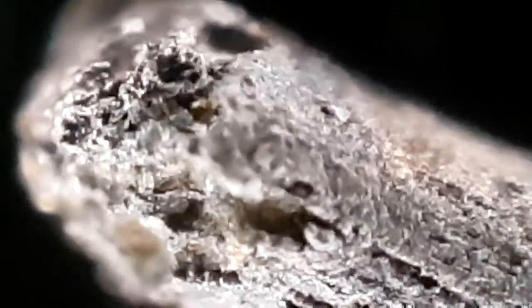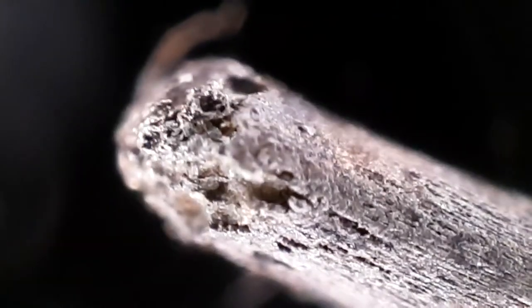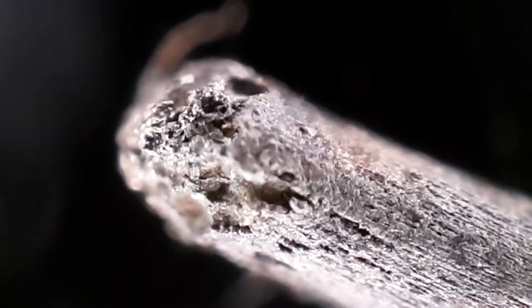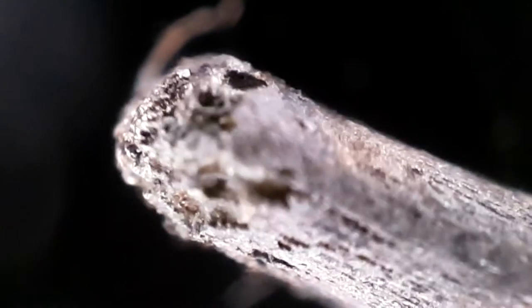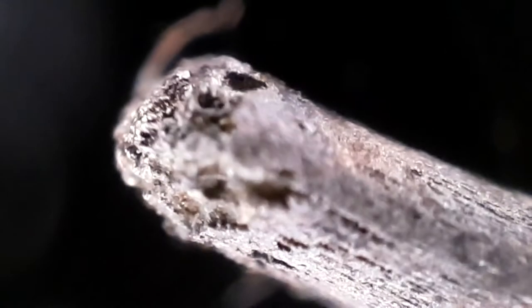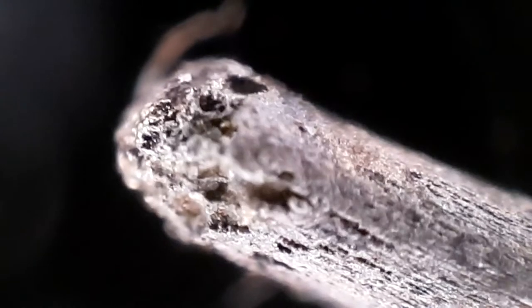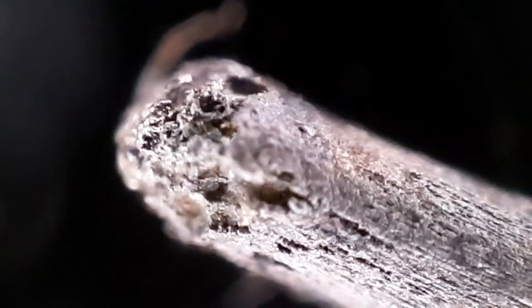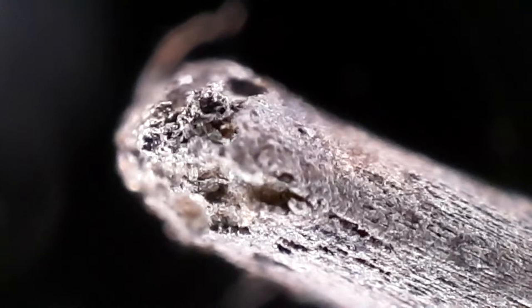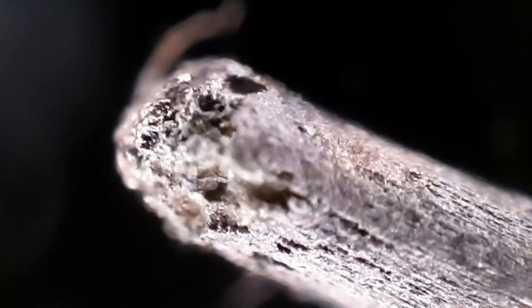So there appears to be a few cavities in spheres, something we've become familiar with. Obviously, one might expect this kind of thing when you have the intensities of welding rods. Was this done with high current discharges? Who knows? But certainly it does seem to have these spheres in cavities at this tip end here.